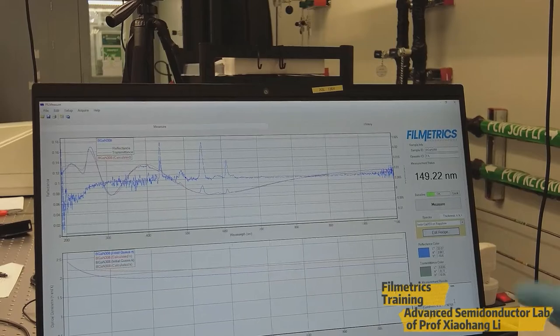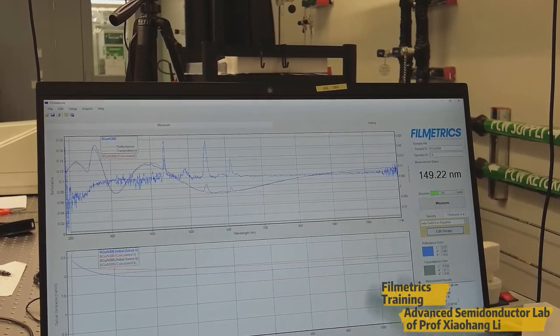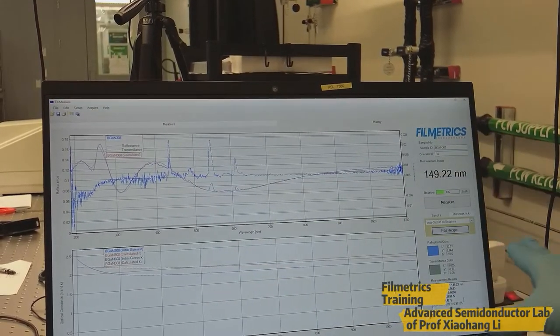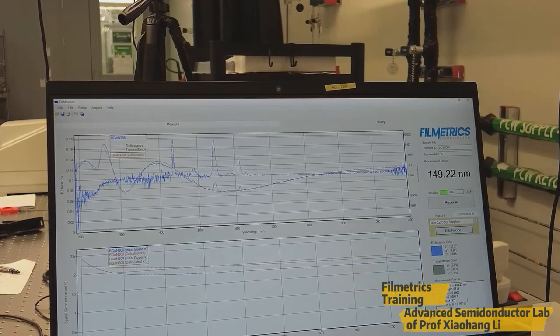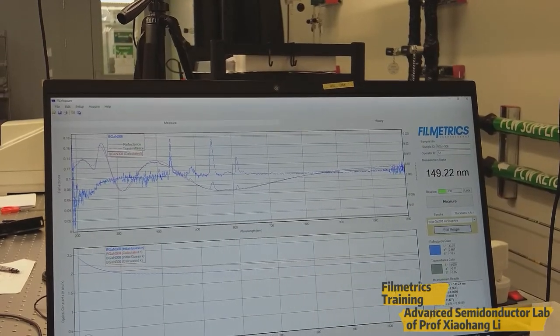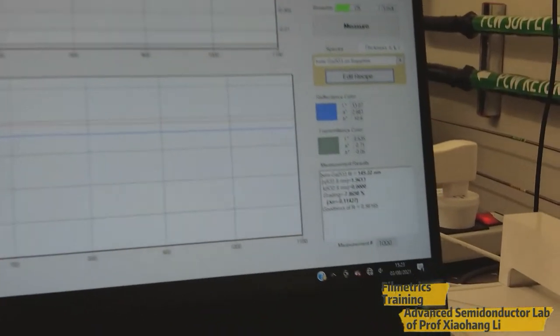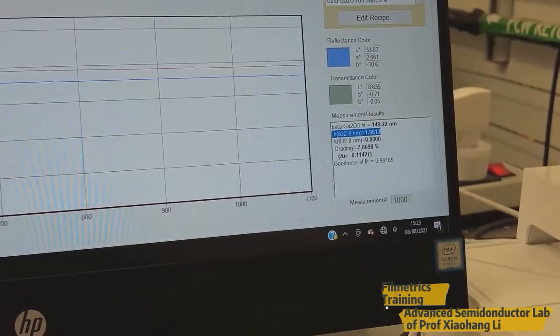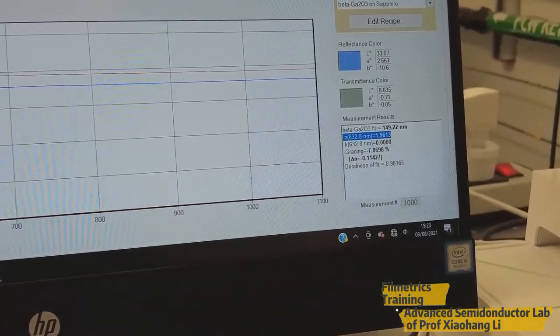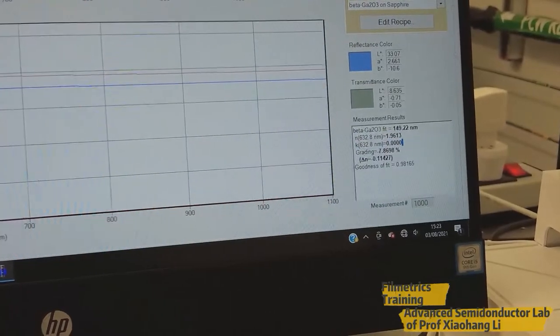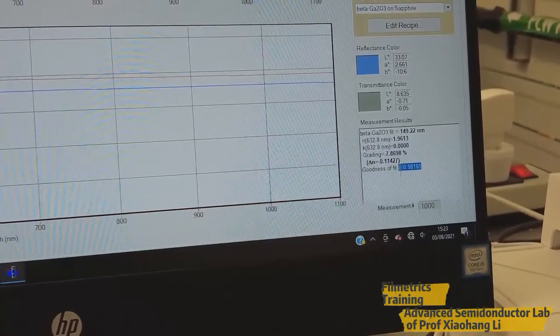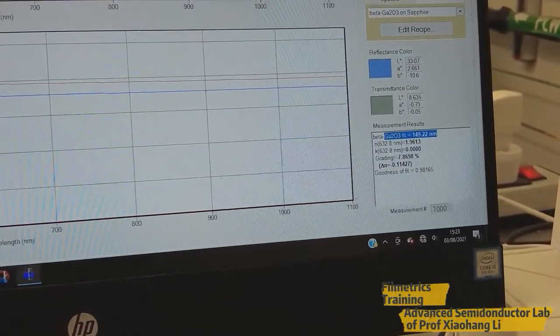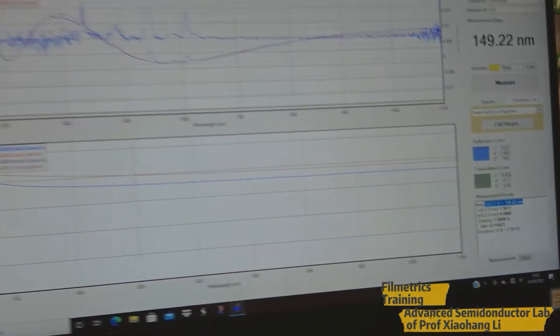So after performing this reflectance measurement, it will automatically fit it and we will get the value of thickness. And here you can see the further information like this is the refractive index, this is the K value, and this is the goodness of fit, and this is the thickness of the sample.